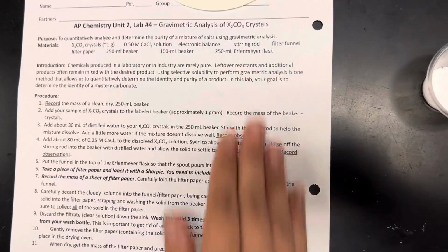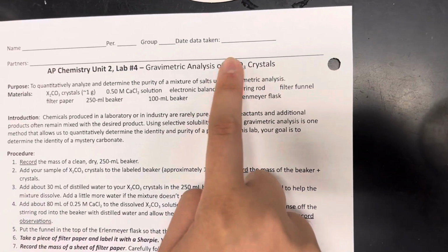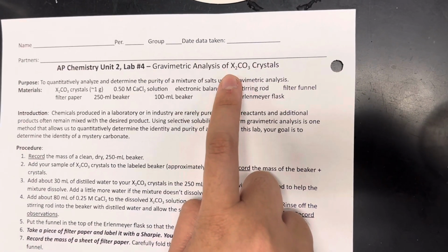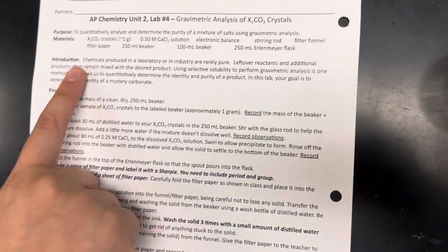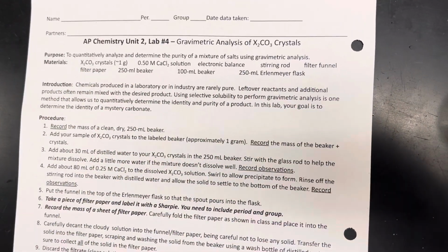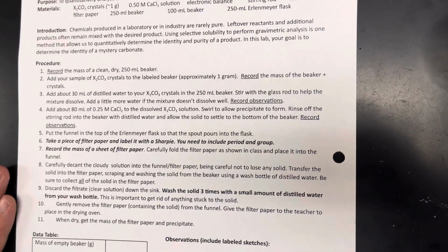Hello, this is our AP Chemistry Lab: Gravimetric analysis of X2CO3 crystals. The X is the mystery, so we're trying to figure out what the mystery chemical is in these crystals. You're going to read the introduction, look at your materials, and then I'm going to do the procedure for you so you can get the data for this lab. So you should be copying my data.